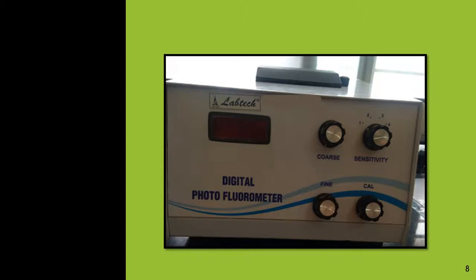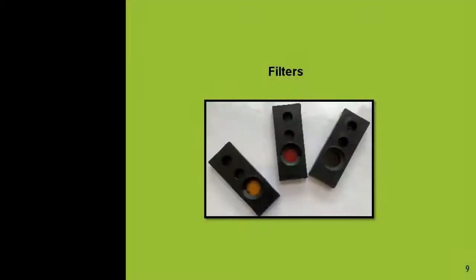Now let us have a look at the filters. You can see various filters of different colors. Based on our sample we can choose the desired primary and secondary filters.